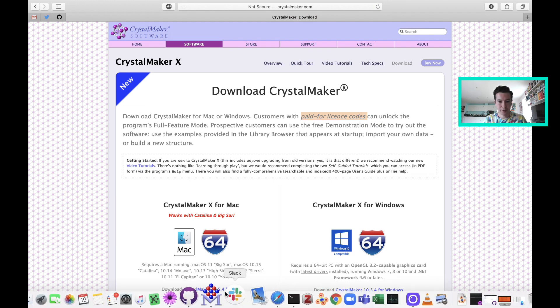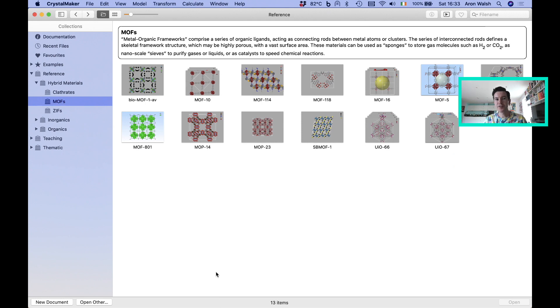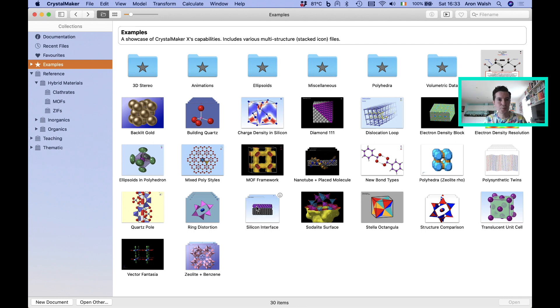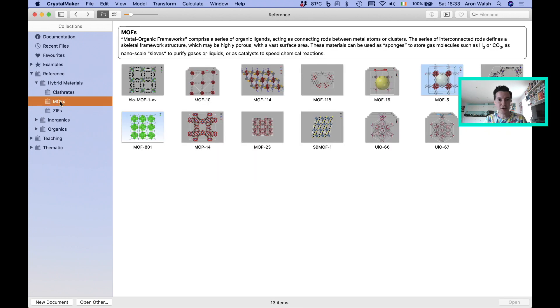When you first open the package, it usually brings up the collections panel. This is a range of different structures that the developers have found interesting, and it's a really good place to see the range of structures that occur in material science — both inorganic systems like minerals and organic systems including proteins. They're also showcasing the power of CrystalMaker, with examples of dislocation loops and interface structures. I'm going to show you one example, which is a metal-organic framework — a crystal built from organic and inorganic building blocks. I'm going to open up MOF-5.